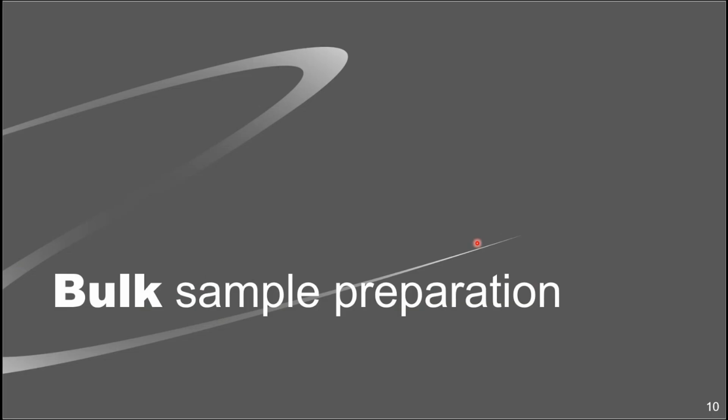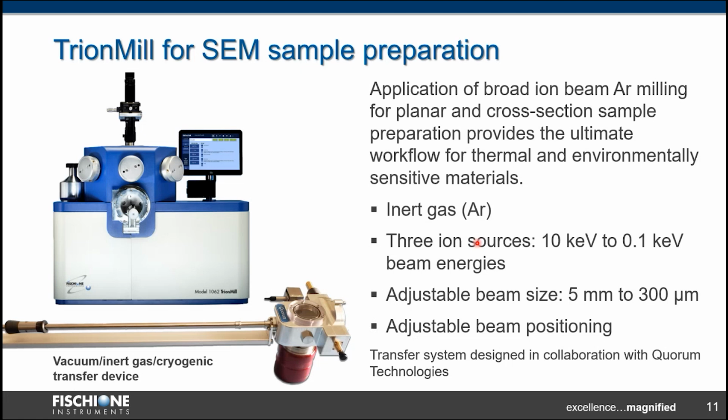Let's now focus on bulk sample preparation and investigation. Samples of magnesium were prepared using the model 1062 TrionMill argon broad ion beam milling system. The instrument is fitted with three ion sources, allowing ion milling using energies from 10 to 0.1 kV, and has adjustable beam size and beam position.